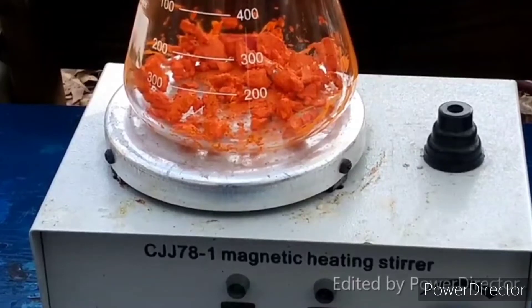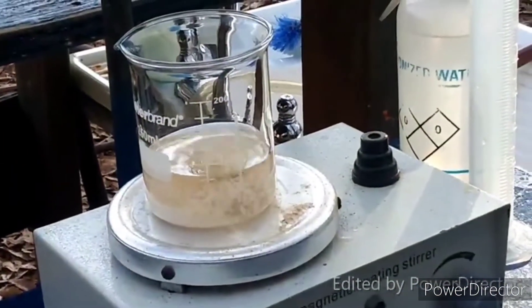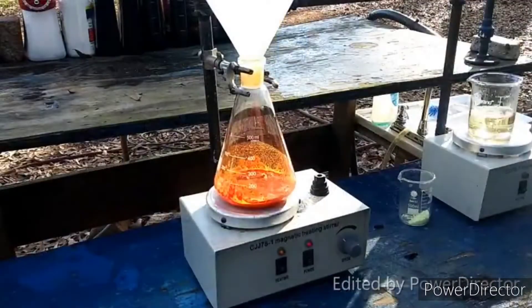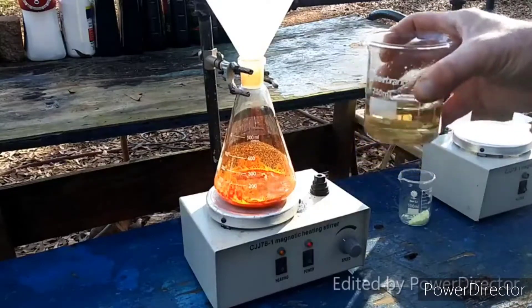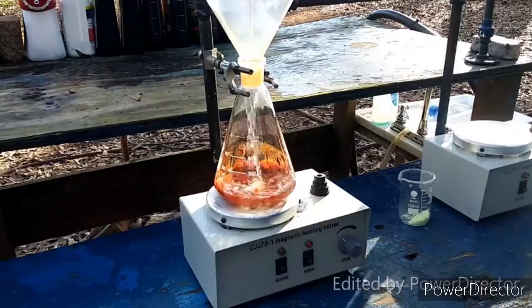I will come back when the sodium sulfide has finally dissolved and I'm ready to move on to the next step. Alright, now all of our sodium sulfide is dissolved — that didn't take very long at all. And now we are going to add it in here; you can tell I added a little bit of water in here.